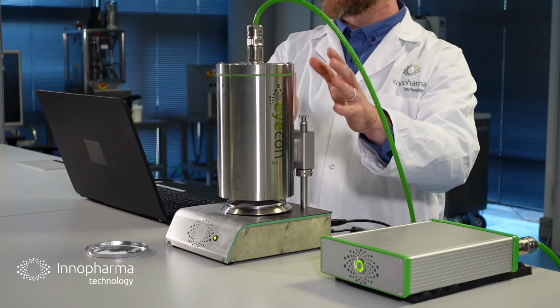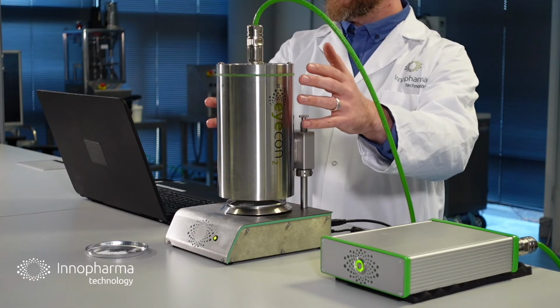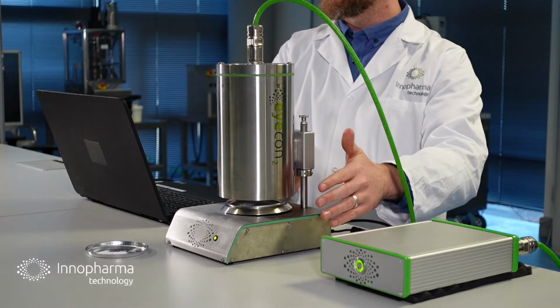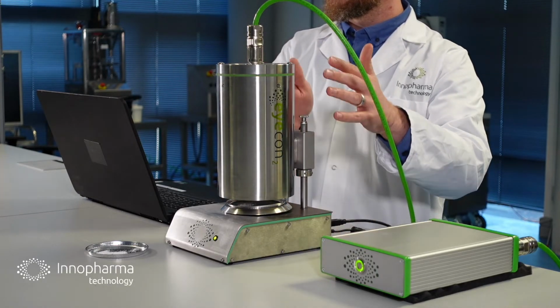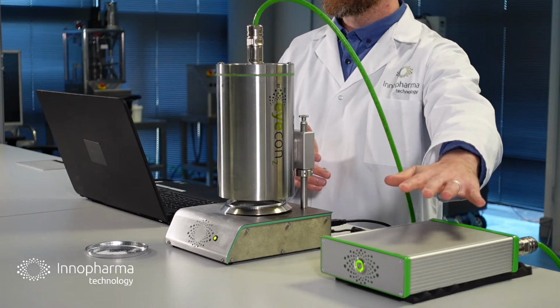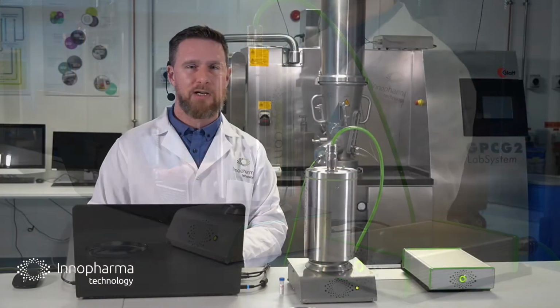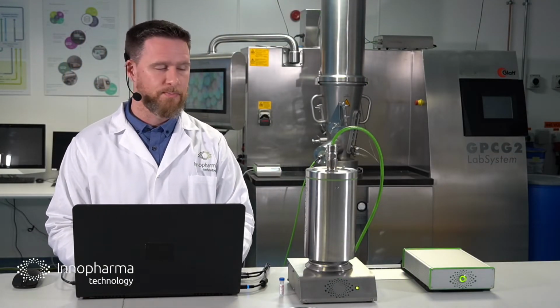It's ATEX rated, IP65, all these good things for your environments. We have it mounted here on our analytical automated stage. So this makes it a benchtop unit in this configuration. And then we have the green communication cable here running back to our connections hub, which then runs back to the laptop here with our software EyePASS that does all the heavy lifting for image analysis.